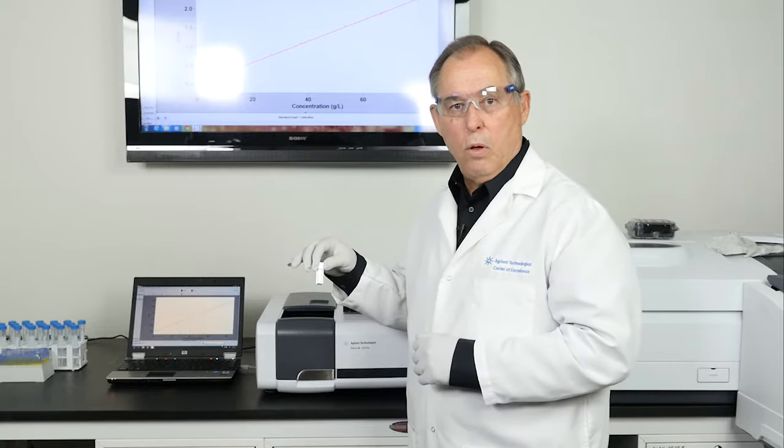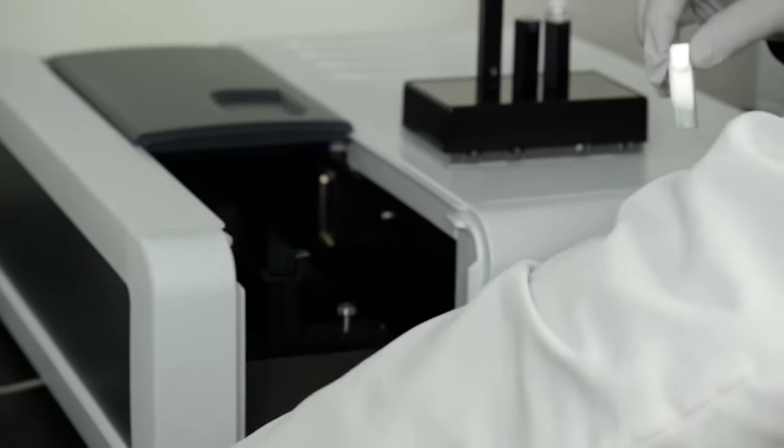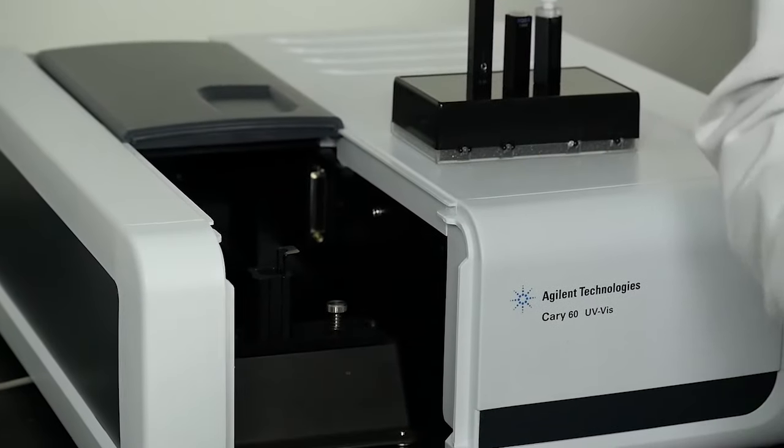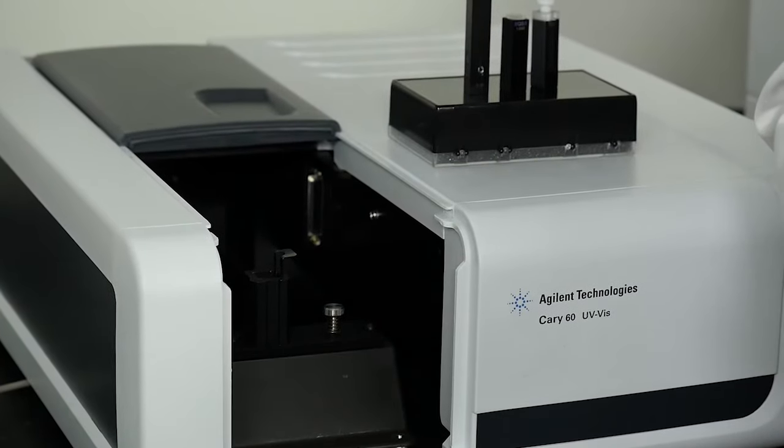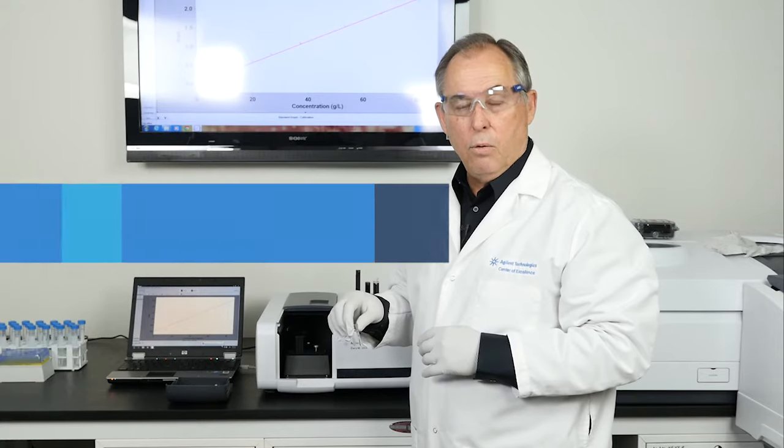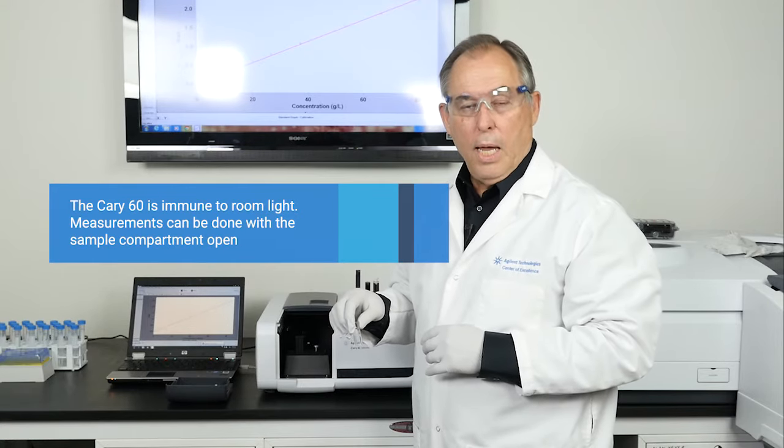So first I can take off the sample compartment lid because the Cary 60 can measure with the sample compartment lid off. It has a technique or a feature called room light immunity.